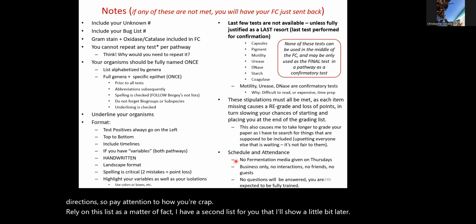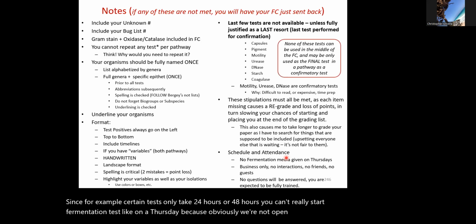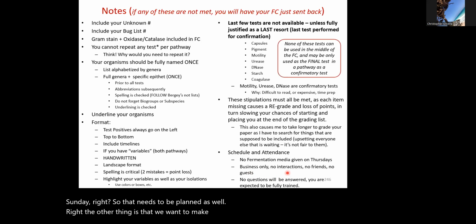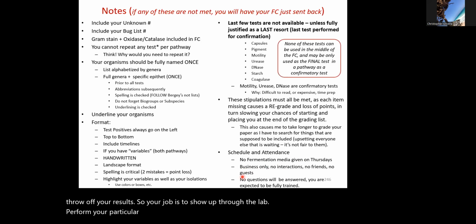Now, there are some tests that have some limitations too. Since, for example, certain tests only take 24 hours or 48 hours, you can't really start a fermentation test on a Thursday, because obviously we're not open on a Saturday or a Sunday, right? So that needs to be planned as well, right? The other thing is that we want to make sure that we're trying to reduce contact and even contamination of your samples, because even somebody sneezing in there obviously can throw off your results. So your job is to show up to the lab, perform your particular tests, and that's it. Get in, get out. That's the plan, right?